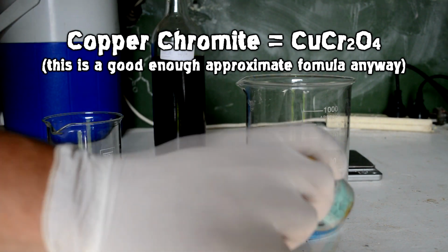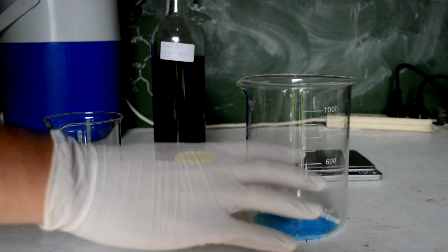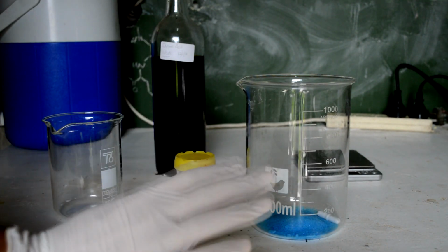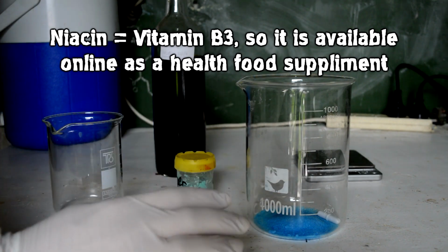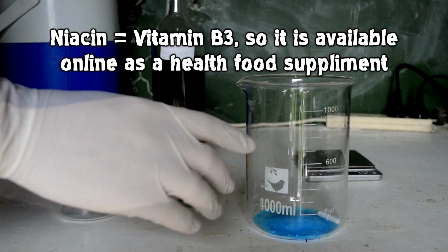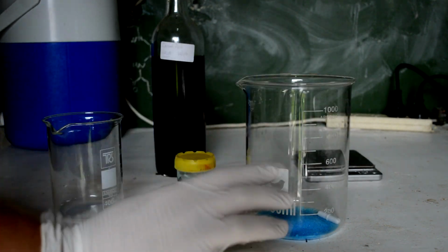Basic copper carbonate is very easy to make, and of course I have some on hand, but putting in the extra effort now to make the catalyst doubles our yield later on, which is useful for me because I only got 250 grams of niacin. It was a little pricey just because it didn't seem very available in Australia. Doubling our yield seems worth it, especially because the decarboxylation and distillation is also quite involved.